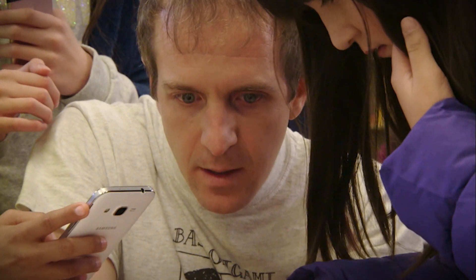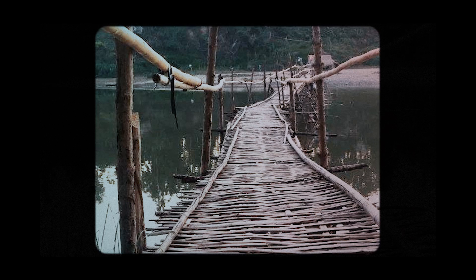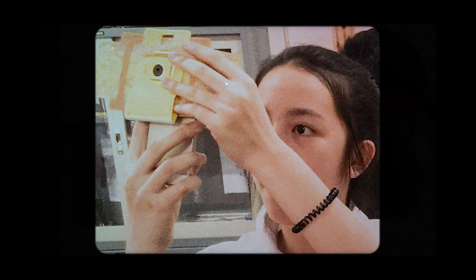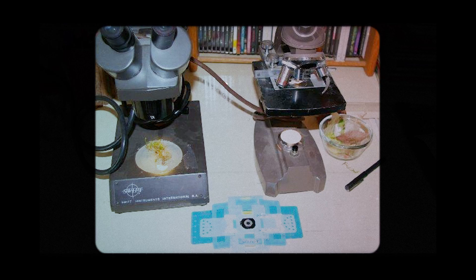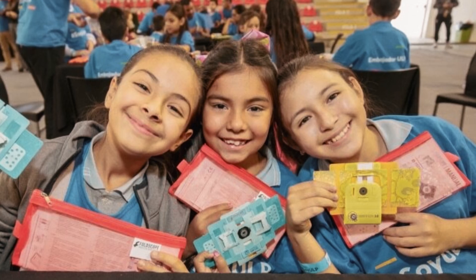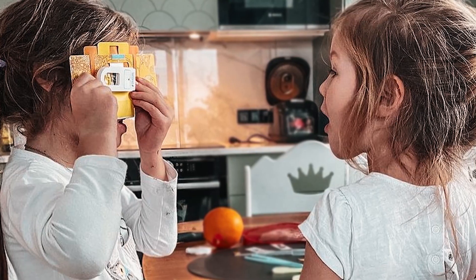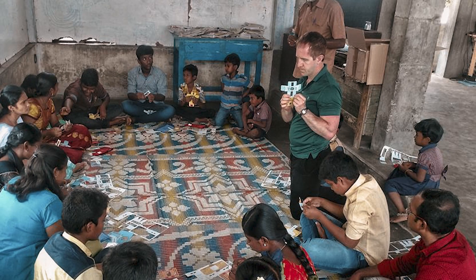Everybody deserves the right to explore science, no matter what your background is. The most important work has really happened in the community, which remains independent from the commercial entity, because the community is driven by the community of users. There was a guy in Seattle who heard about Foldscope and decided to quit what he was doing. He biked from Laos to Cambodia to Thailand, all across for the next year, running hundreds of Foldscope workshops — that's what he did. Everybody has an innate capacity to create knowledge. When you share something with them that allows them to see the same world they've always seen before, but in a new way, it can be very exciting.